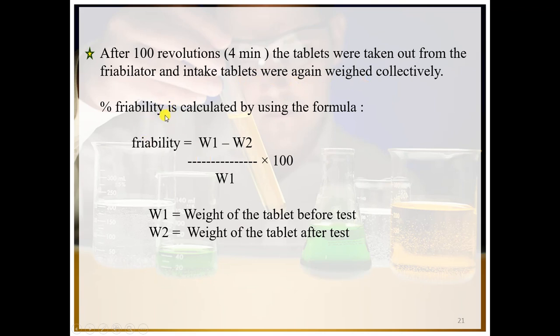Now, how will you calculate it? The percentage friability is calculated by using a very simple formula.